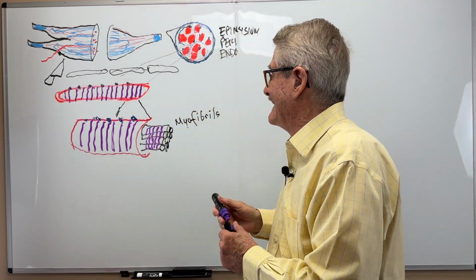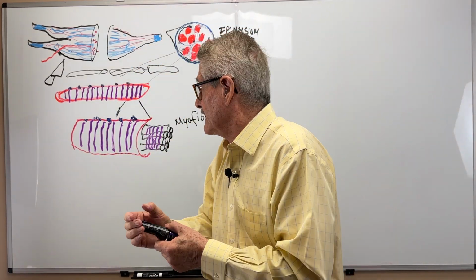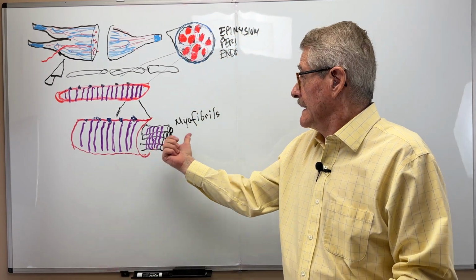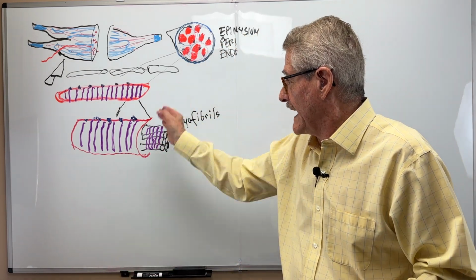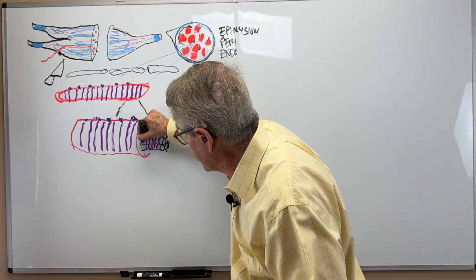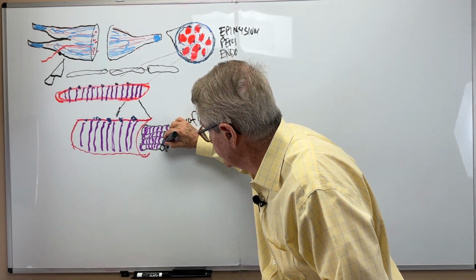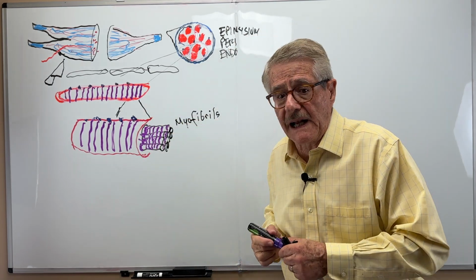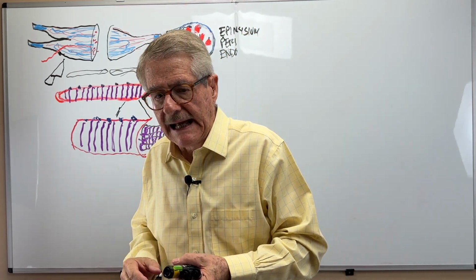So if you imagine a skeletal muscle, it's like holding a pack of cigarettes and showing it to somebody. The myofibrils will be the cigarettes, and all of them are stained in the same fashion vertically, if you try to understand it. So these are the myofibrils. Now, what are the myofibrils composed of? They are composed of myofilaments of actin and myosin.